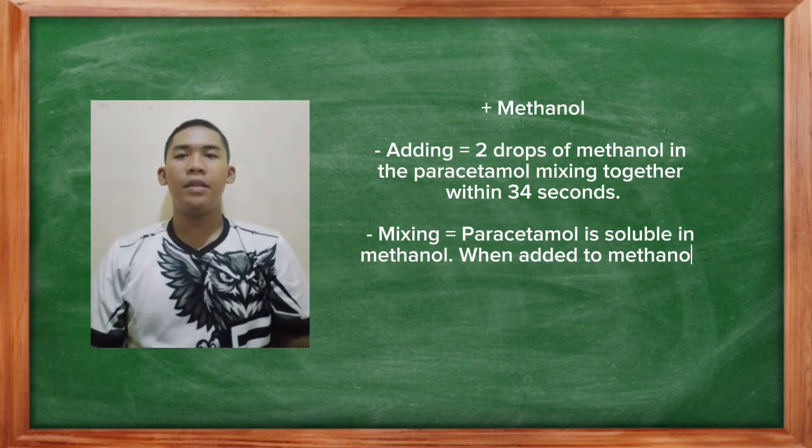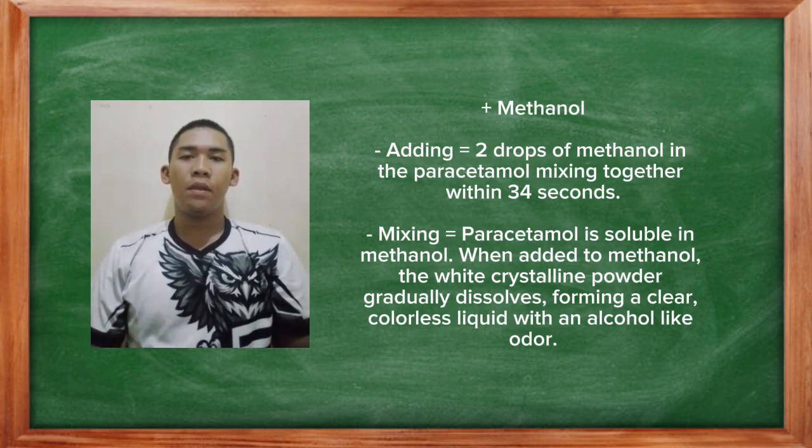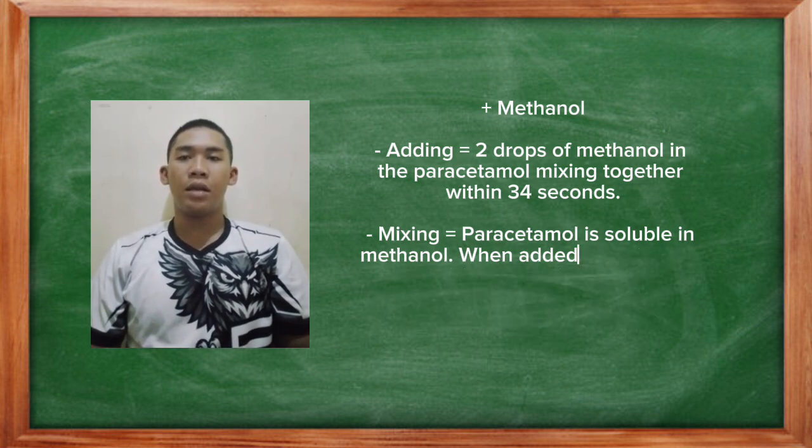Methanol. Adding 2 drops of methanol in the paracetamol, mixing together within 34 seconds. Mixing: paracetamol is soluble in methanol. When added to methanol, the white crystalline powder gradually dissolves, forming a clear, colorless liquid with an alcohol-like odor.